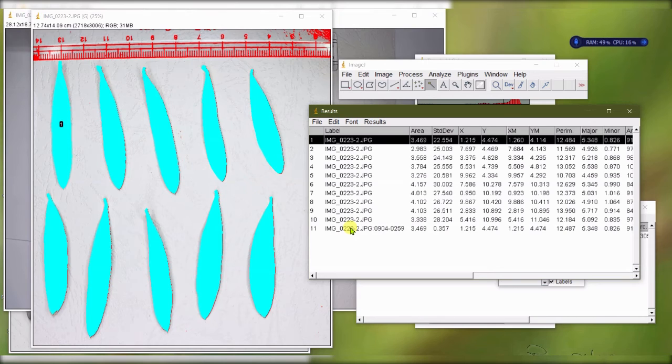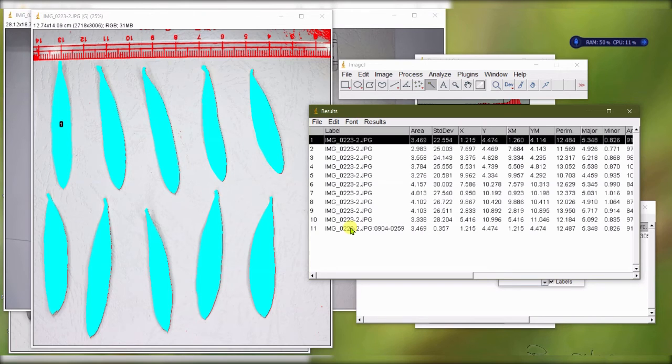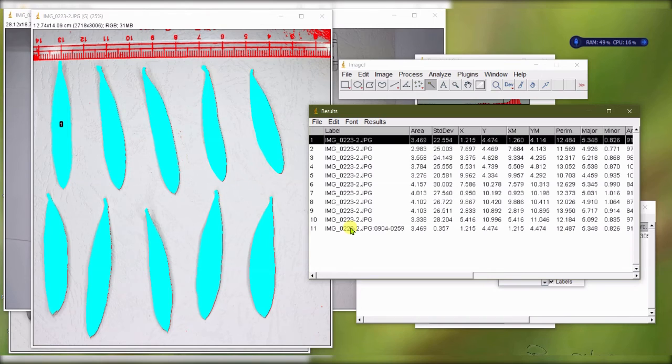You can have as many leaves as you want scattered all over the place, and ImageJ will still be able to count them and give you their leaf area and their length and their weight and all of the information parameters that you are interested in. That's how simple ImageJ is.